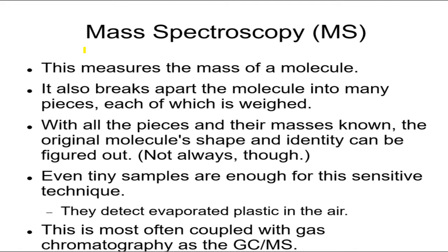In fact, that's why it's called mass spectroscopy or mass spectrometry. It tells the mass of every molecule you can think of. Again, it's a little more complicated than that, but you can certainly tell the mass of any molecule. So it can tell the mass of heroin is different from the mass of gasoline. The mass of cocaine is different from the mass of fentanyl. Not only can you tell that something's coming through, you can also tell the mass of what's coming through, and therefore you can identify different molecules. Now, different molecules may have the same mass, so it's not unique, but enough of them have different masses for it to be good enough.